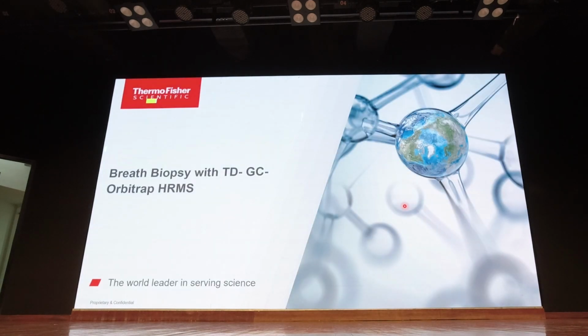You get more information. And one more application which is becoming very popular now is breath analysis. Okay. What is breath analysis?